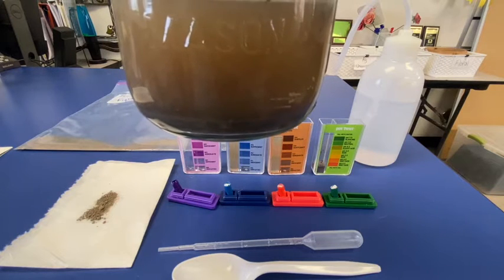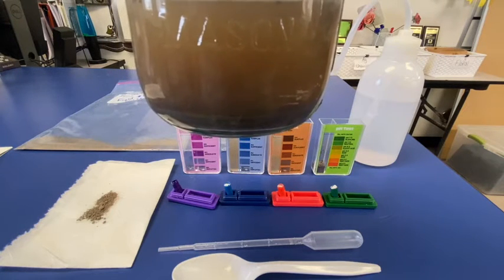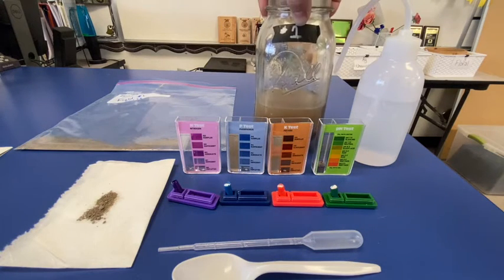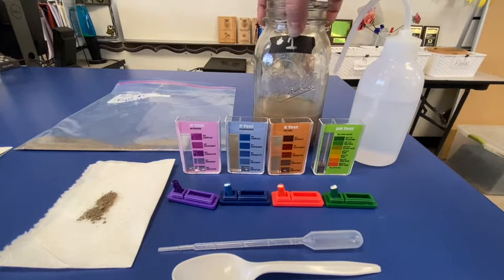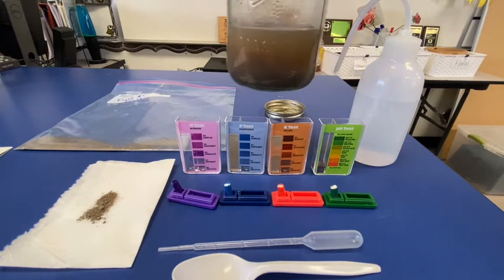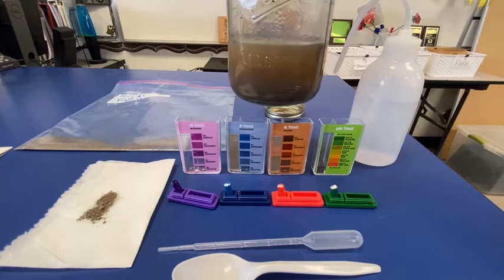As we know, gravel is most likely at the bottom — it's a little bit heavier, very big particle size. Above that we might have some sand, silt, and clay. Suspended in that water is the clay, so that's what's floating in the water.